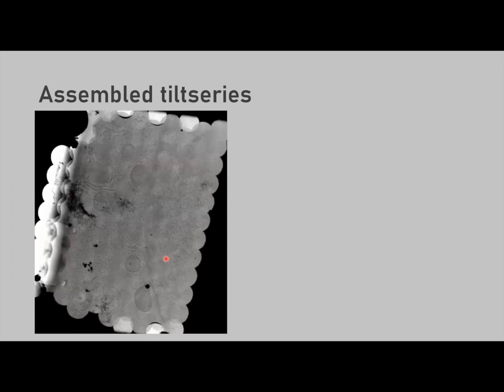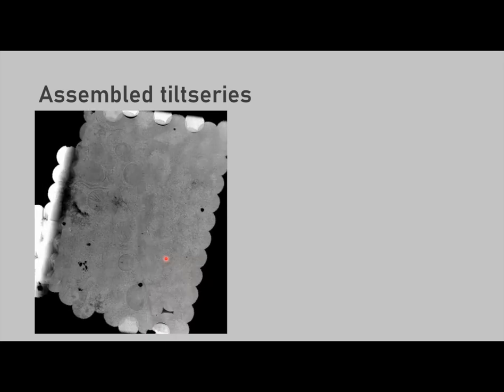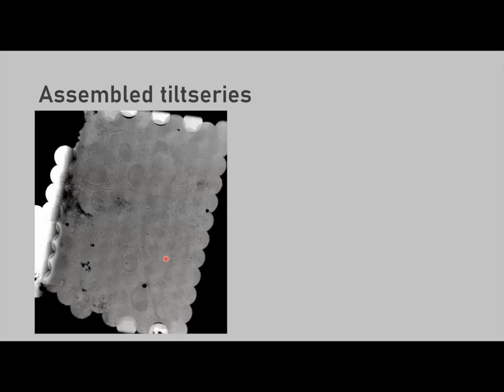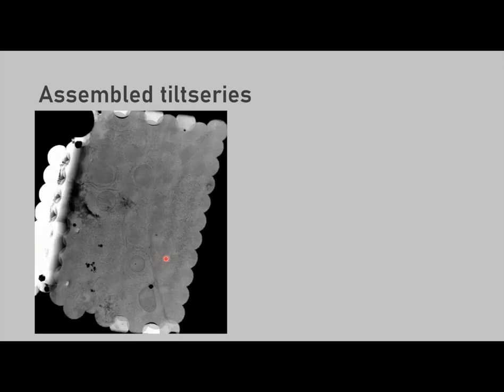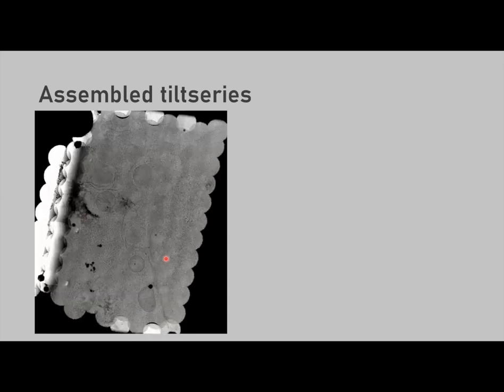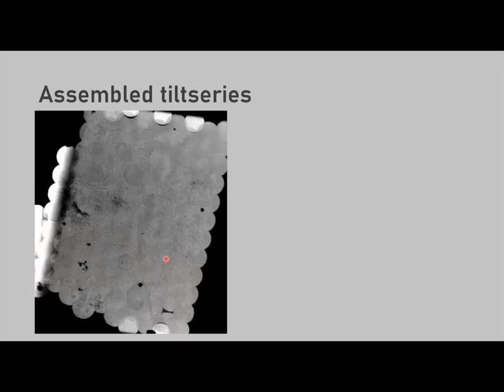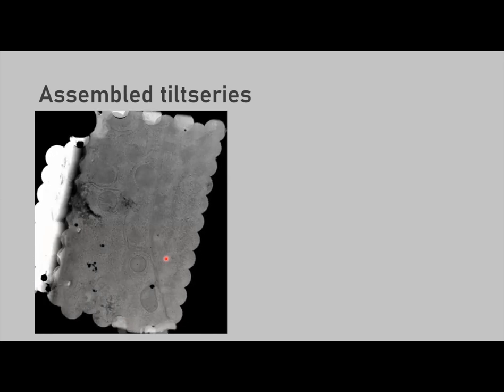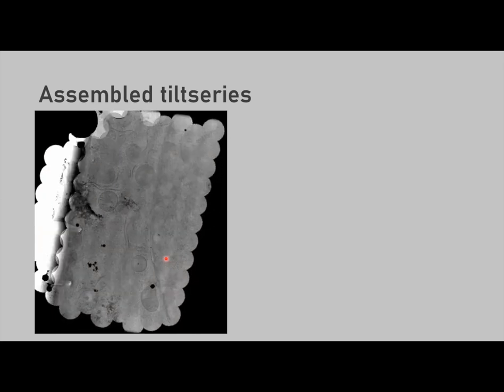So far I haven't been completely successful yet at reconstructing tomograms from that. Tilt series with a billion pixels get hard to manage, and my first naive approach of just binning them by a large amount is harder than you think. I think it mostly has something to do with the lamella not being very precise planes, so it's really hard to reconstruct it into one continuous volume. And it might also be that the lamella warps between the individual exposures.